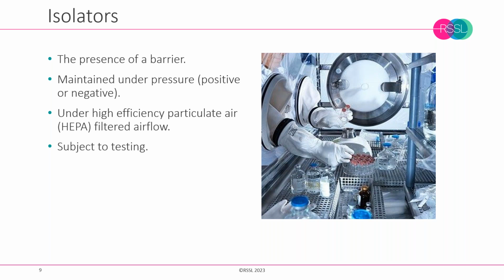And with the exception of where we are handling products that could cause human harm, so certain medicinal products like cytotoxic drugs, then isolators, when operative, tend to be positive pressure, and that's one of the key contamination control principles.